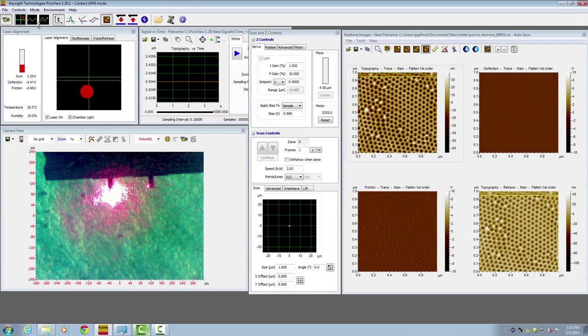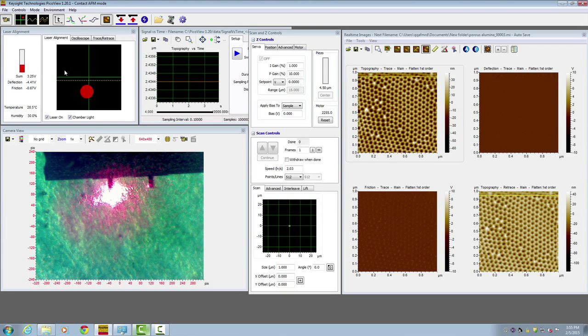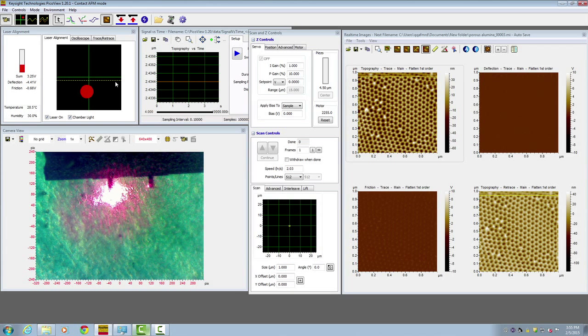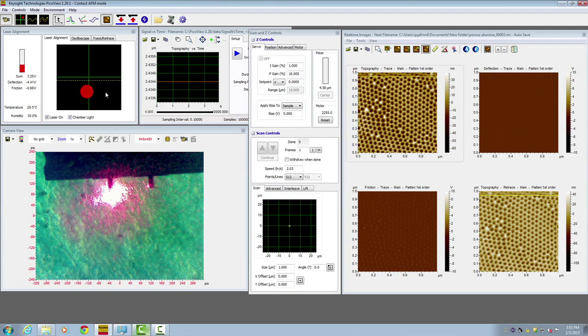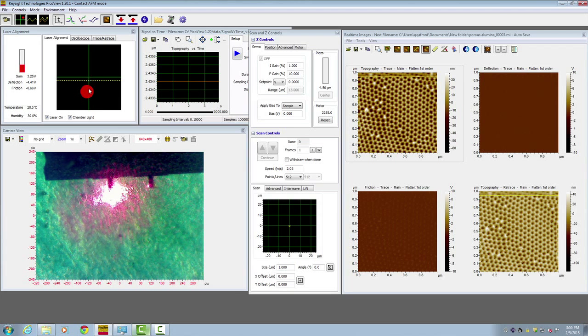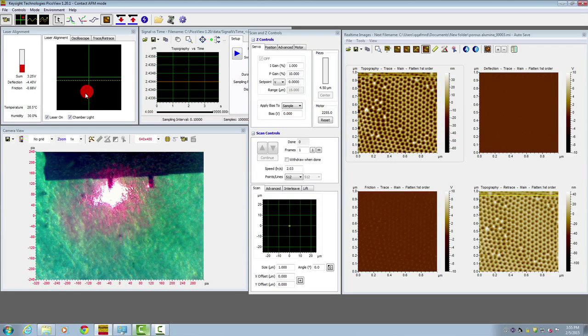Notice when the software is in contact mode imaging mode, the laser alignment window shows a yellow dotted line. That's a reminder that you should align the detector so the photo red dot is below the center line. Here the red dot is at negative 4.4 volts.